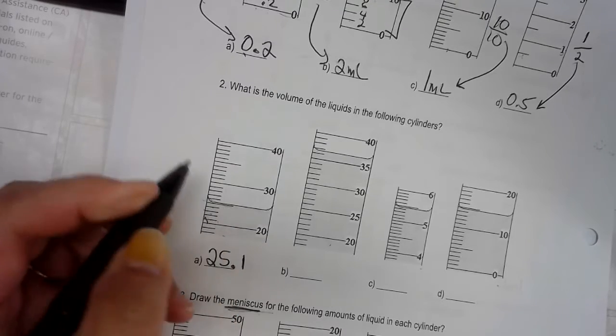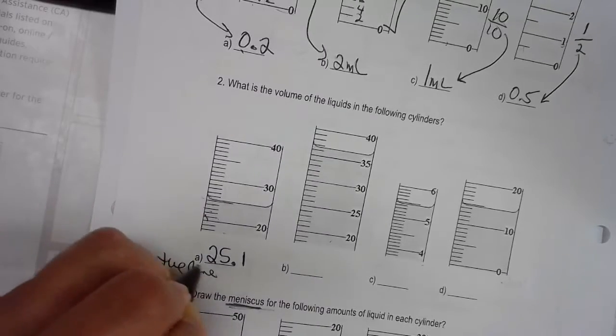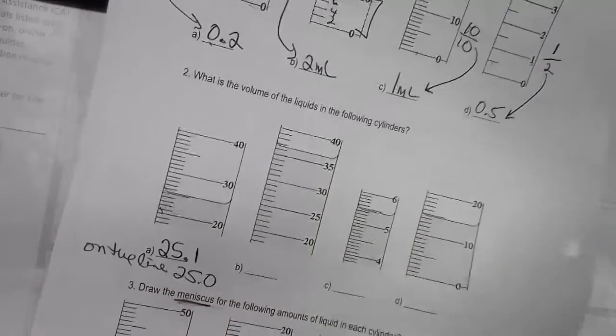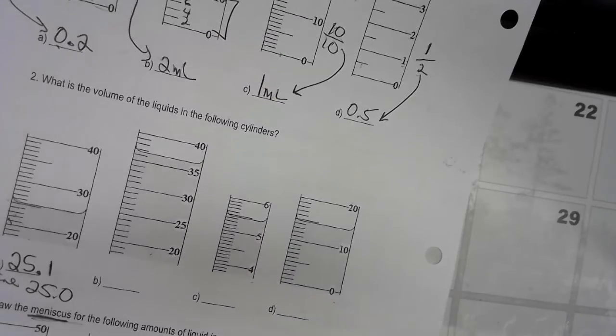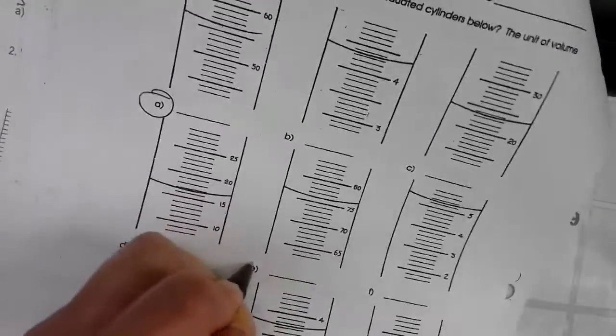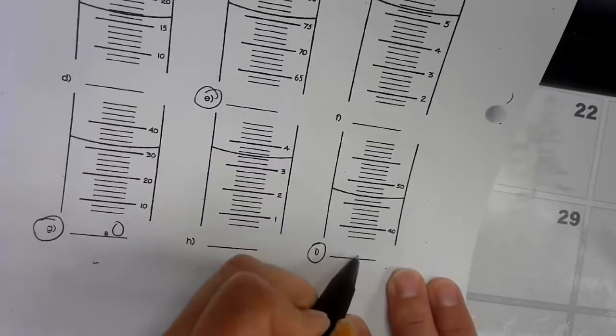If it was exactly on the line, then you would put 25.0, and you'll see that on some of the homework. If I flip to the homework and you go to page 2, you're going to see that on this one, because it's directly on the line, I would circle them. And then you would have this one going directly on the line. You're going to do the 0.0. It's going to be something 0.0. Also on this one, it's going to be something 0.0. So just to let you know that those are the 4 that apply to that, okay?